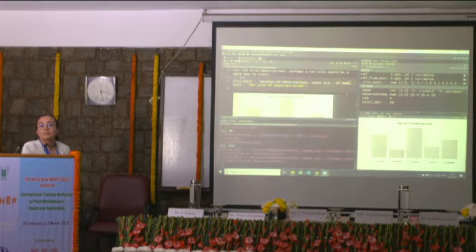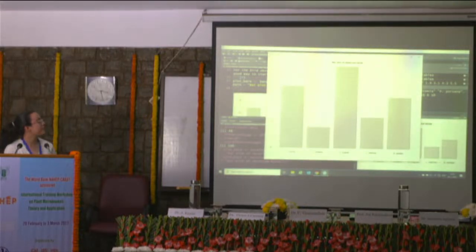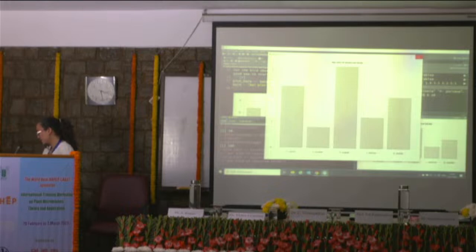In the plot panel, you can see there are also functions like zoom. Oh yeah, that's true. We can click zoom in here. It will open a new window, and then you can see it bigger, or you can adjust it because sometimes you just need it in a square.